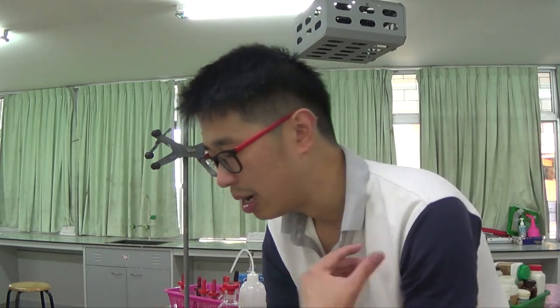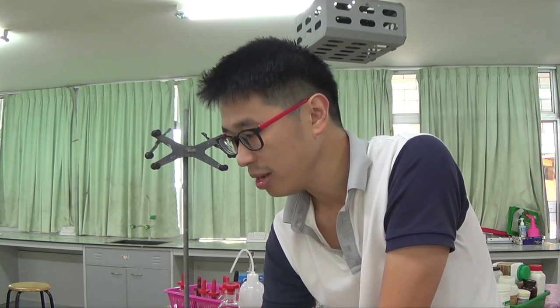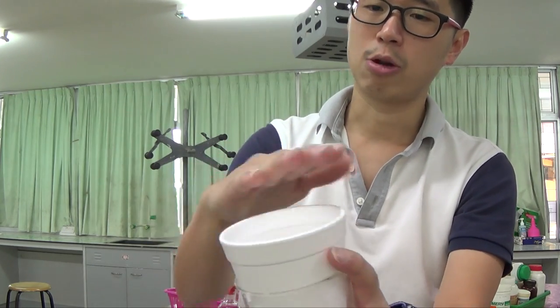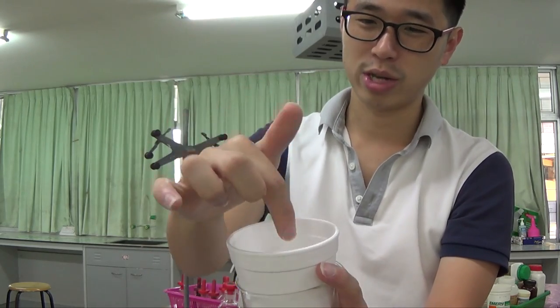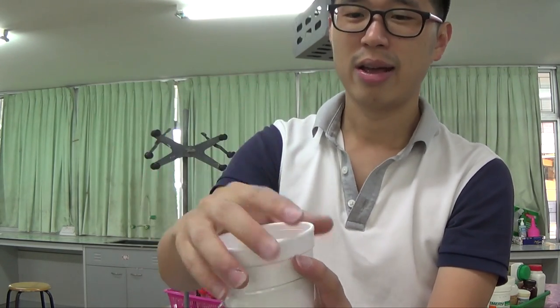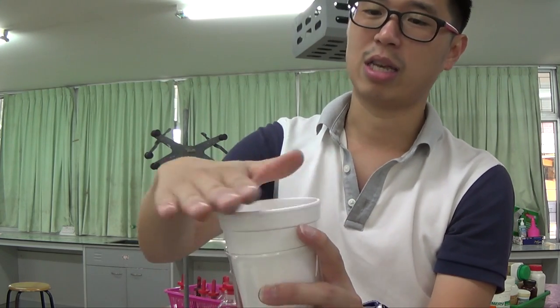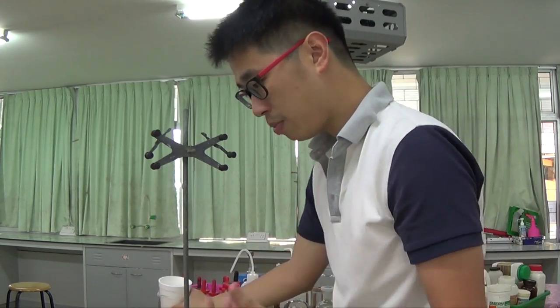It will try and increase the accuracy of your calorimetry experiment, because it will prevent further heat loss, essentially. The other suggestion, of course, is my plastic cup does not come with a lid. I could put a plastic lid on top, like when you put the straw in, that's where you put the thermometer through, and you can still measure the temperature of the solution mixture while keeping the energy loss or the heat loss down, because you have a plastic lid that is an insulator.